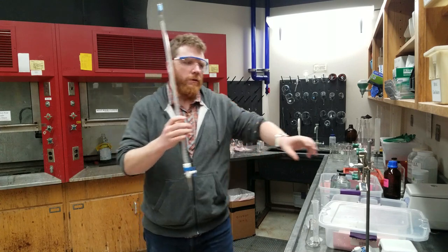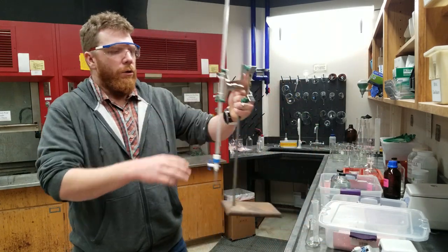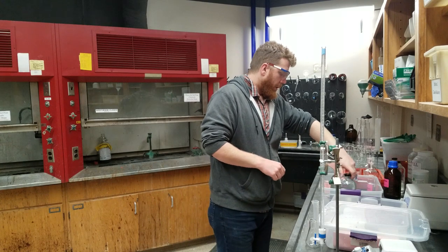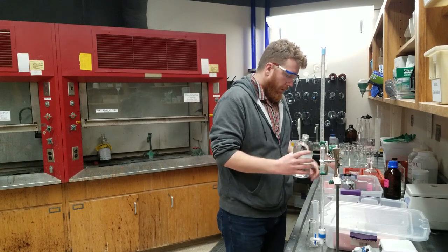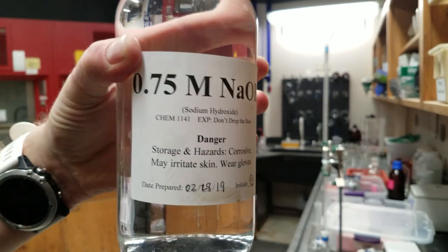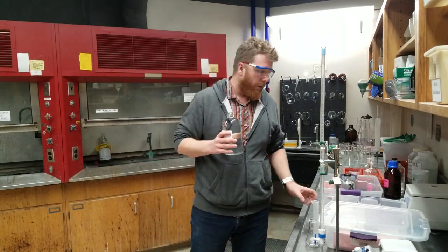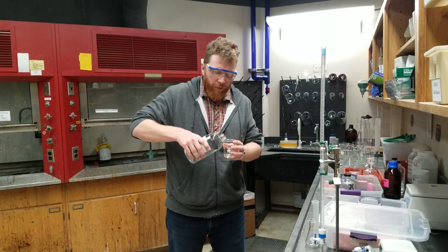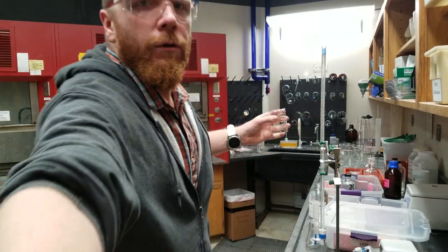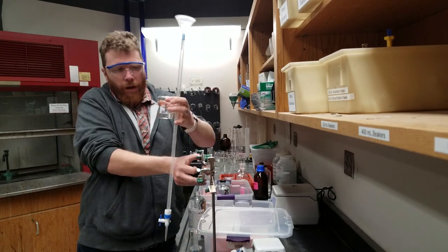To add solutions, you're going to clamp the burette into this clamp right here, get a funnel, and put it at the top of the burette. The base we're going to be working with is sodium hydroxide at a concentration of 0.75 moles per liter, though we'll only be using about 50 milliliters. Before transferring solution to the funnel, make sure your valve on the burette is closed.